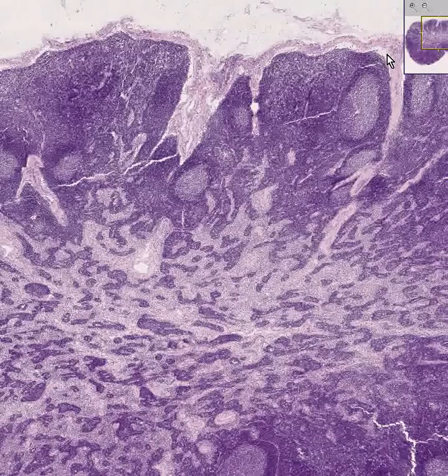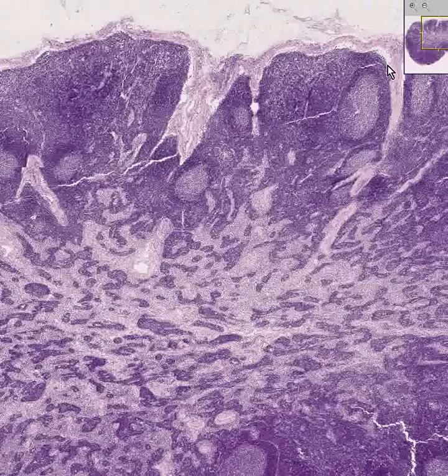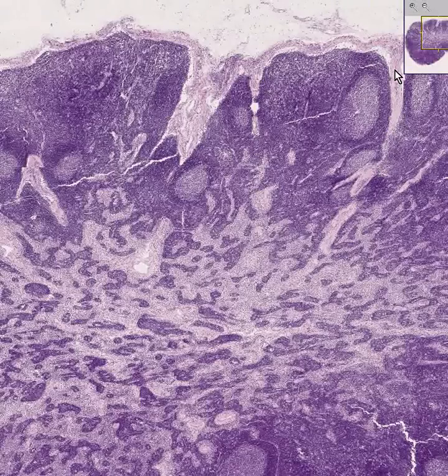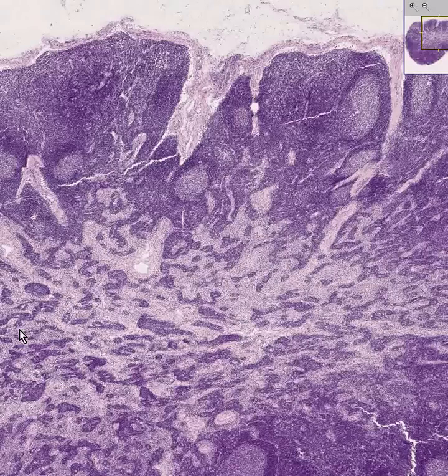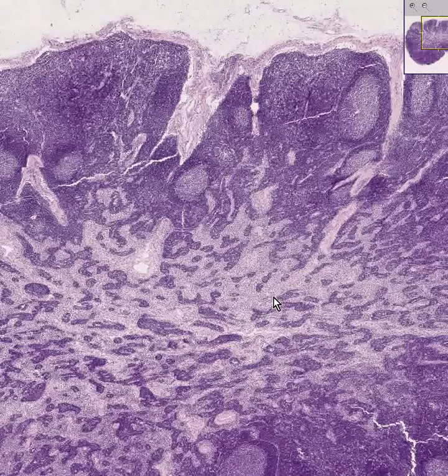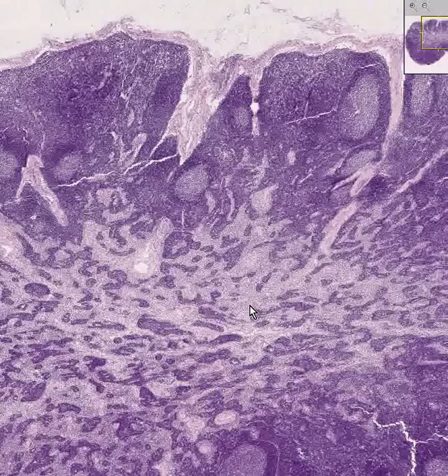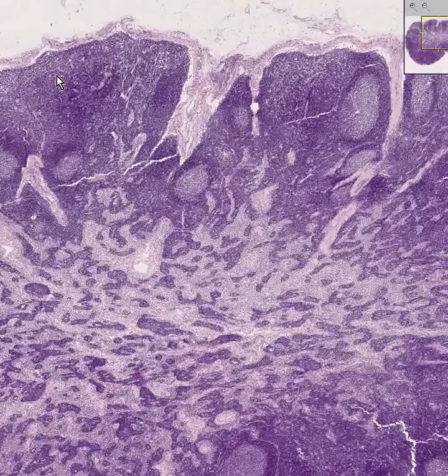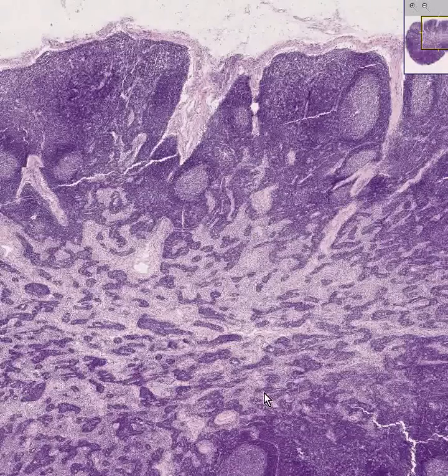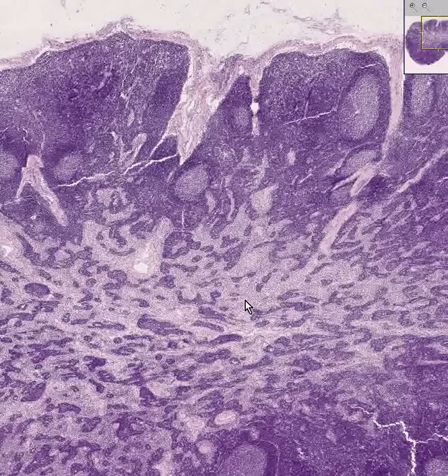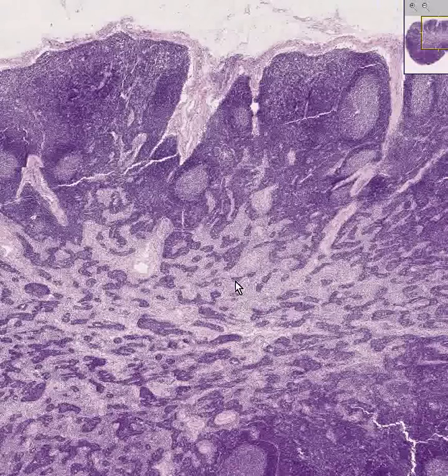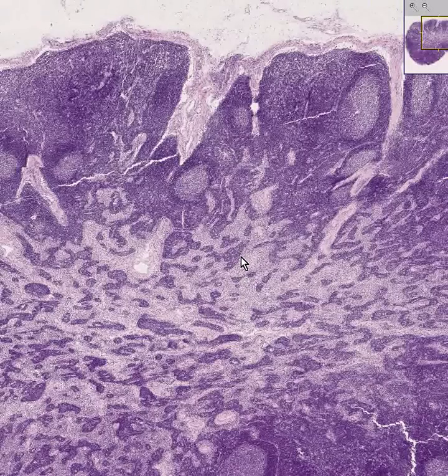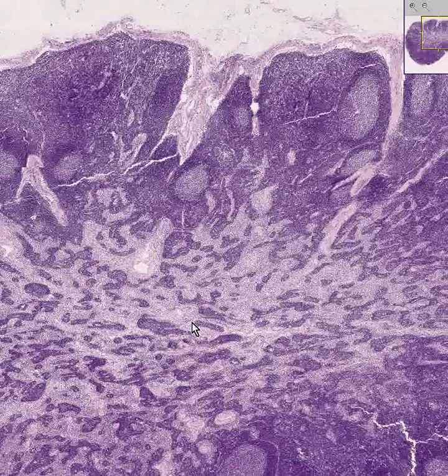In addition, these subcapsular sinuses extend along the sides of the trabecula, which separates groups of lymphoid follicles, all the way down into the medullary portion of the lymph node as medullary sinuses. Notice that in every classical normal lymph node, lymphoid follicles are only seen in the cortex. In the medulla, you see medullary sinuses, which are the lighter areas, as well as medullary cords, which are chiefly lymphocytes with smaller amounts of cytoplasm. This is what makes a normal lymph node.